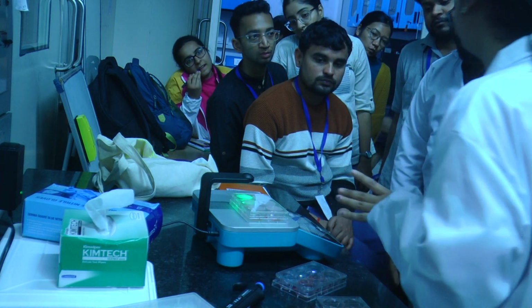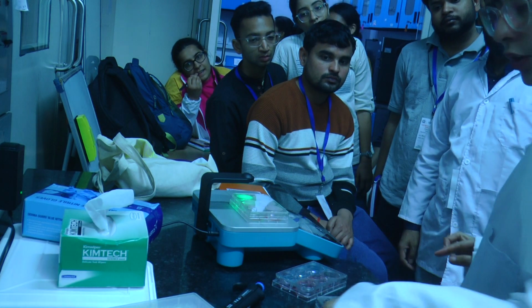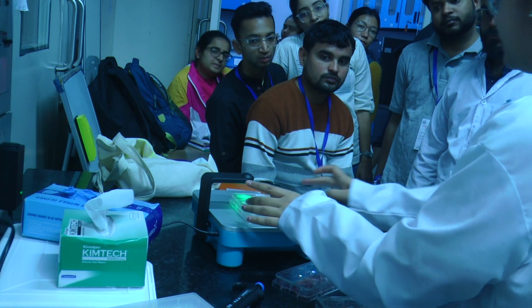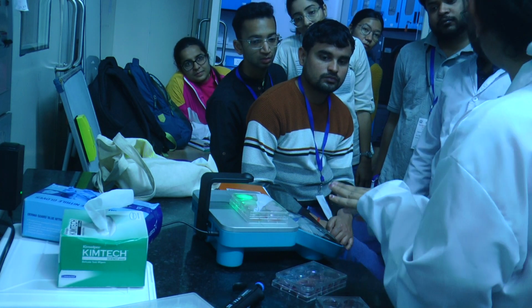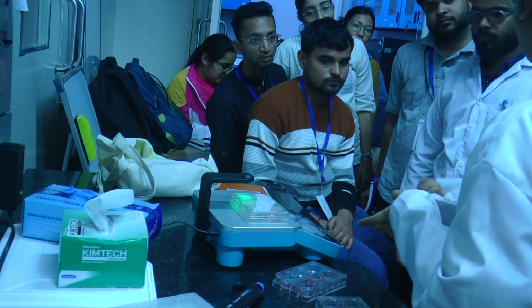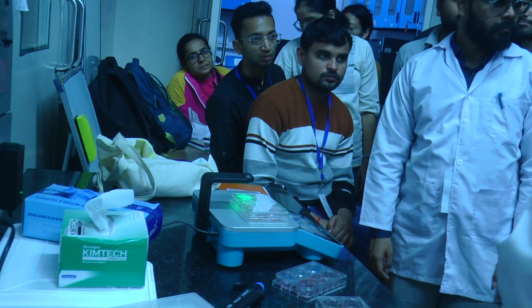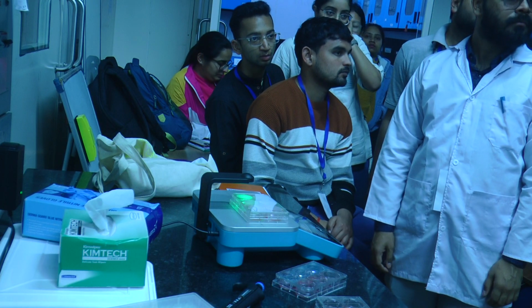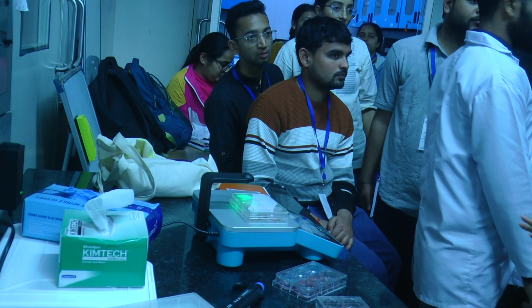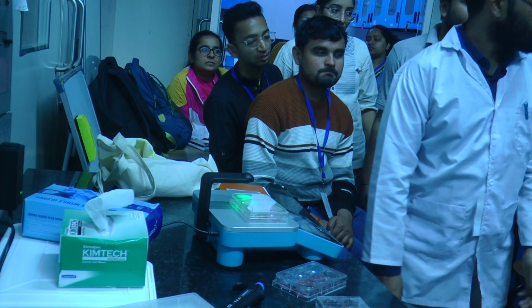Okay, so we can do one thing, six people can come. You can write your name or initials here. I'll give you a marker, and then you can take one and check your confluency, and afterwards we'll add the buffer, and then you can see how it gets extracted. First you start.